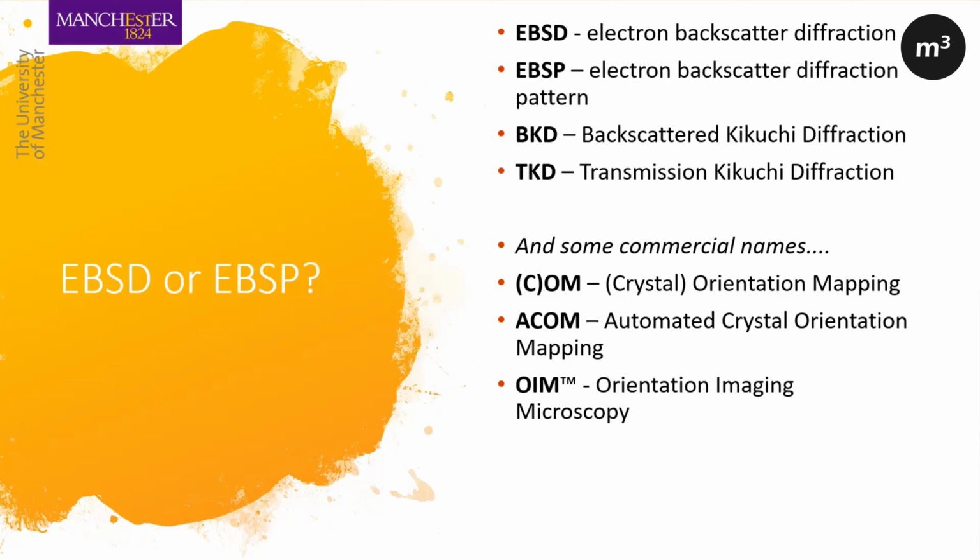TKD is a relatively new phrase that's more often used now, transmission Kikuchi diffraction, which I'll explain briefly as well. And then there are some commercial names which people tend to use, not aware that these are actually not scientific terms, such as OM, ACOM, OIM. So you need to be careful when you're using these in your publications interchangeably.